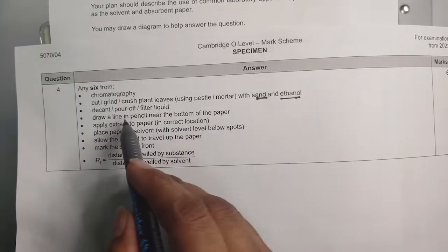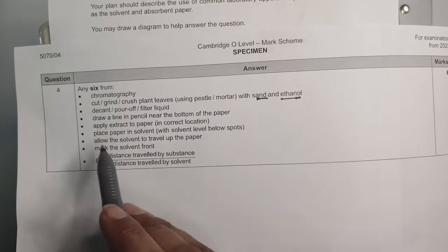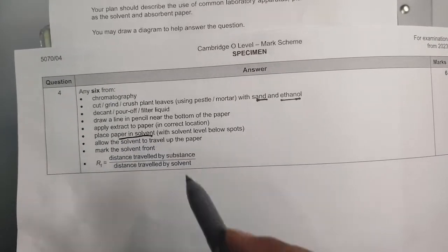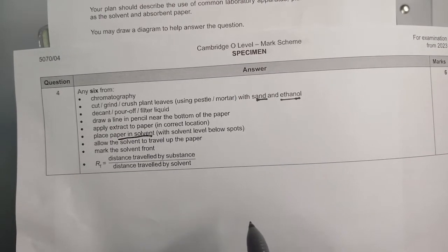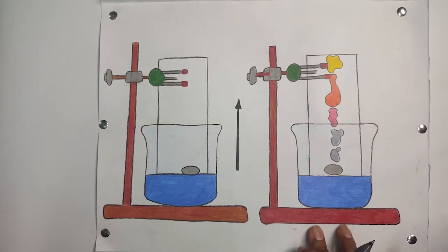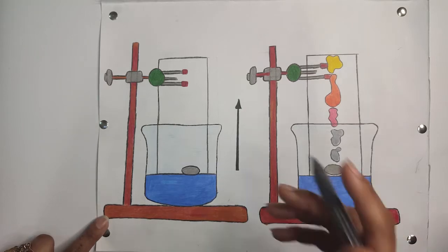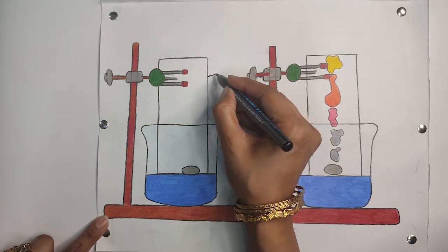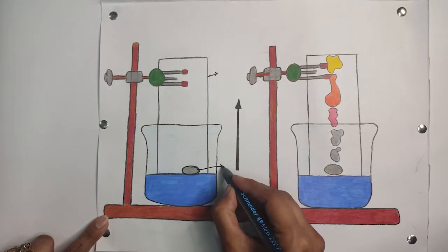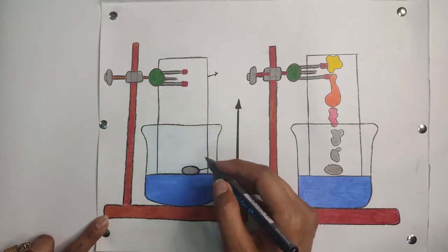Apply this extract, the extract which remains after crushing and pouring off the liquid, and then we will place it in the solvent. Then allow the solvent to travel up. This is our chromatography setup. This is our chromatography paper. This is the spot of mixture that we have applied here. Very small we applied, but after absorbing the solvent, it will expand.